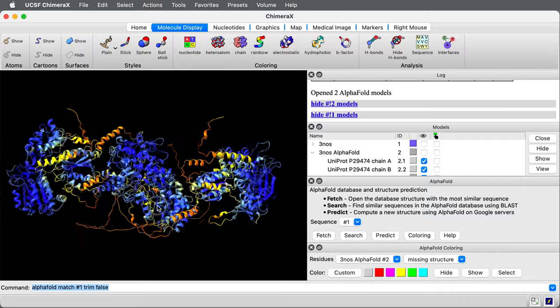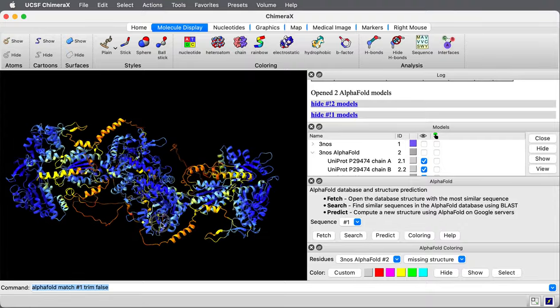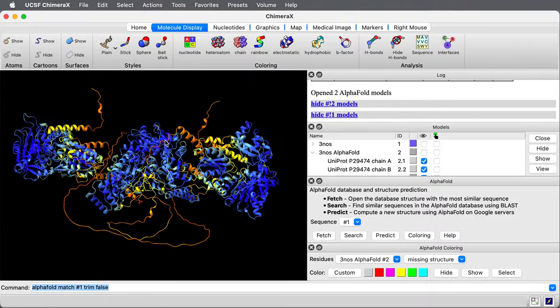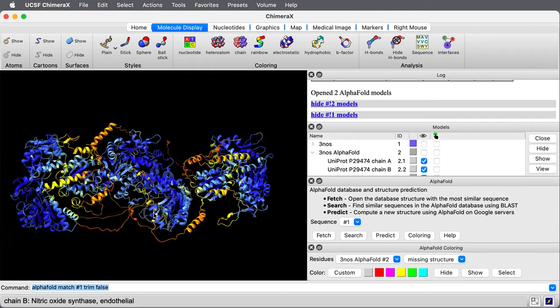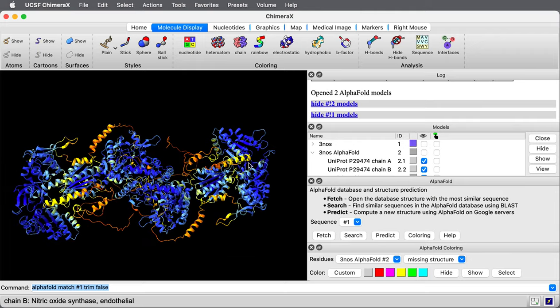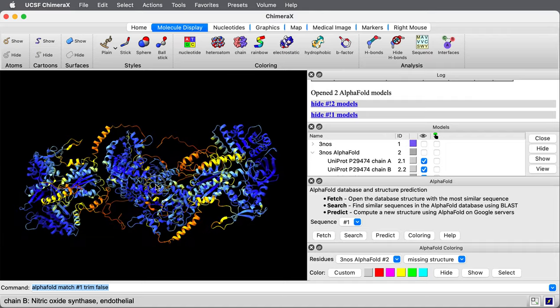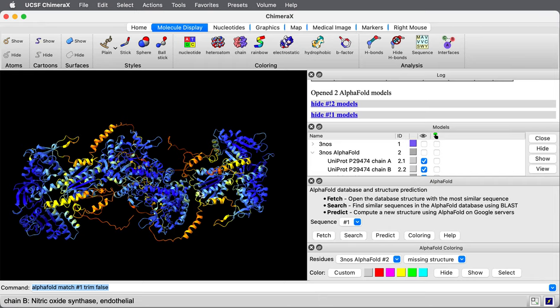The actual configuration of the dimer here, I would not trust that these extra domains are in the right position in the dimer. You can see that the interface between those extra domains and the central part where we have an experimental structure is in yellow and orange. So the prediction isn't very confident and the interface doesn't look very tight either.